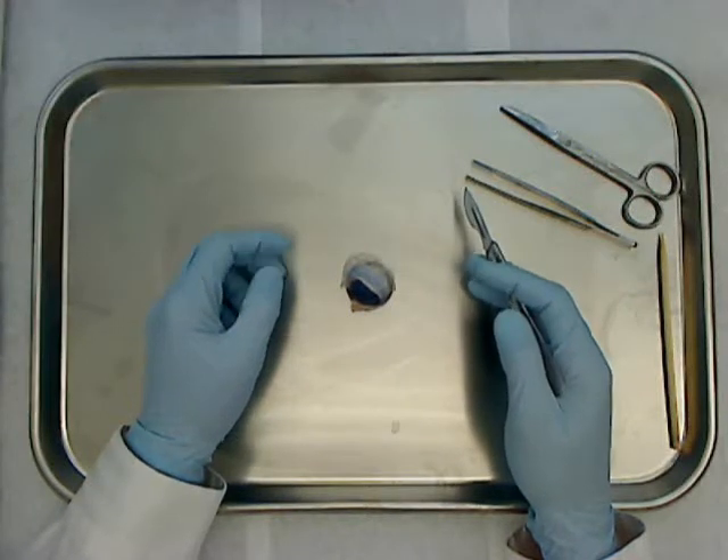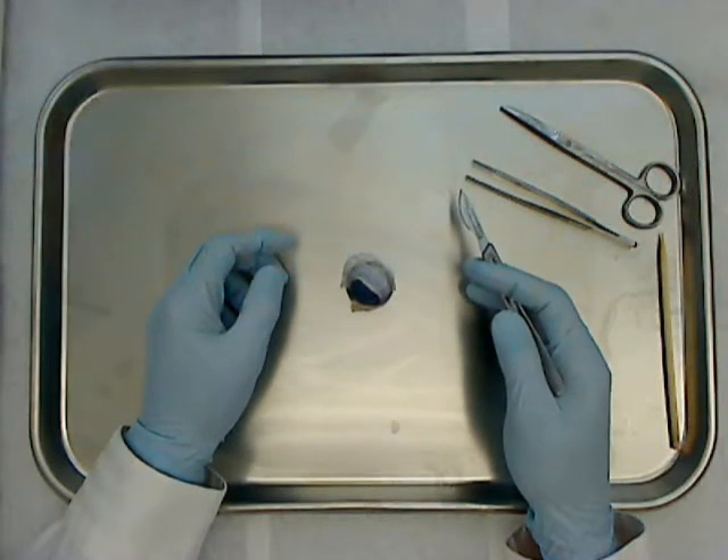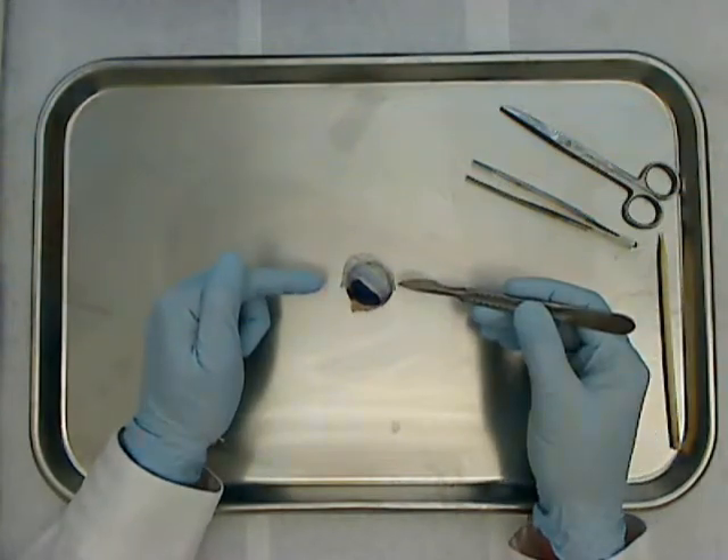Welcome to Anatomy and Physiology at Glen Oaks Community College. I'm Dr. Ren Hartung, and for this video we're going to look at the sheep eyeball.